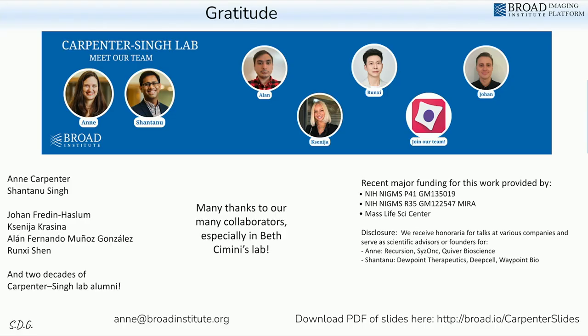I guess the challenge is when you see a manifold of features. All of the above describes a phenotype: we have nuclear features, we have also correlation of ER with mitosis and something else. This is the complexity, this is the phenotype. So if it's a manifold, how do we articulate that in a more intuitive fashion? When it's a mixture of features across channels, across types, then it gets complicated.